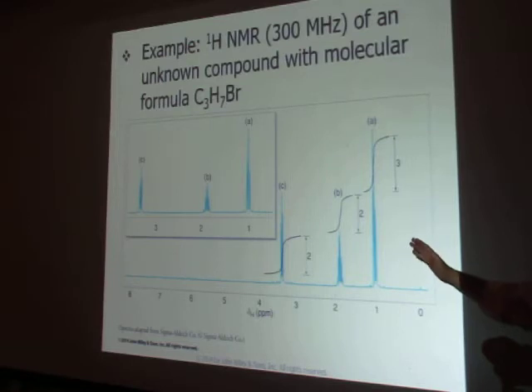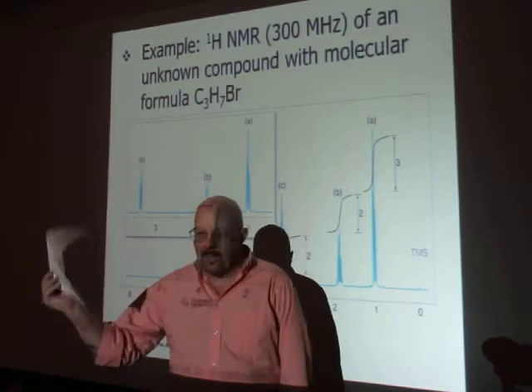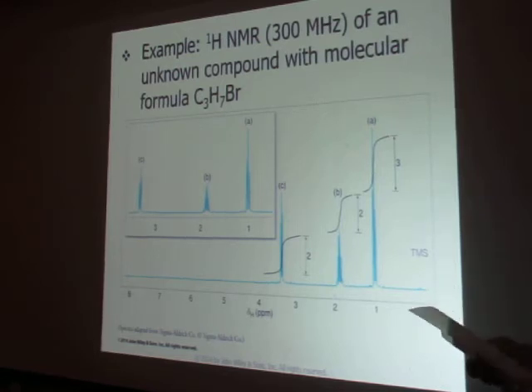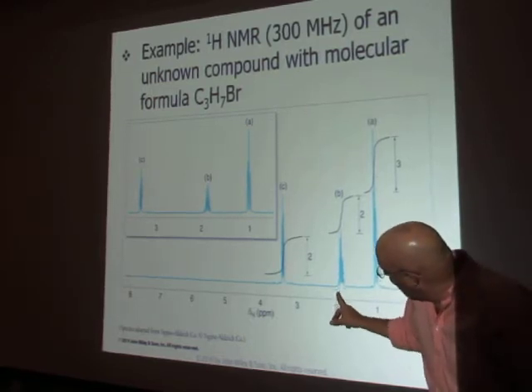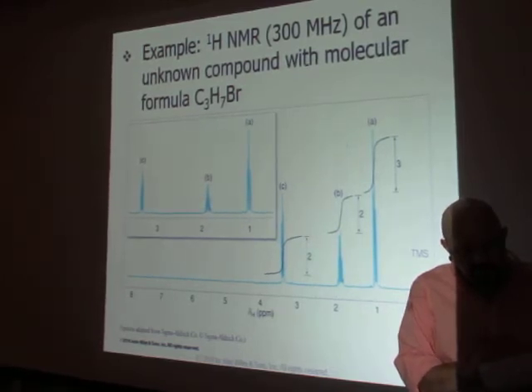Okay, now, the next thing we do, we look at chemical shifts, where things come. Okay, so we got something here at 1 ppm. 1 ppm says that's an alkane. Okay, so that's protons on a carbon that's just all involved in all single bonds. Alkane proton. We got some here at almost 2. When you look at 2, my chart says hydrogen on a carbon next to a carbon of a double bond.